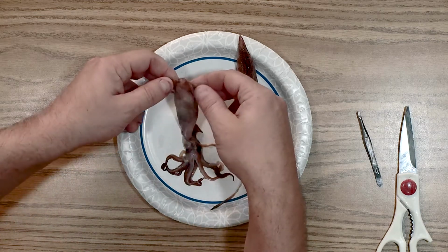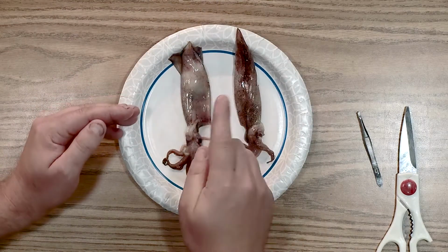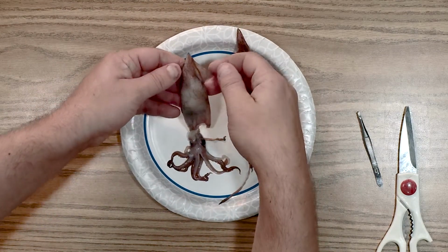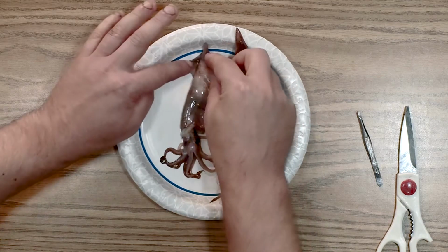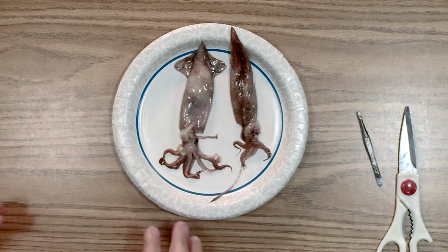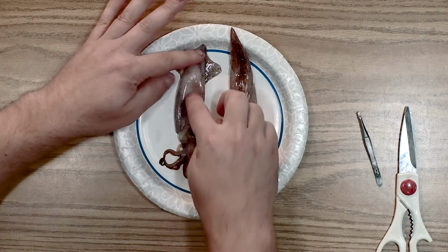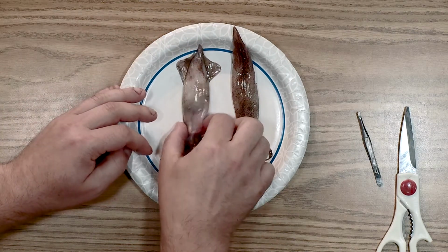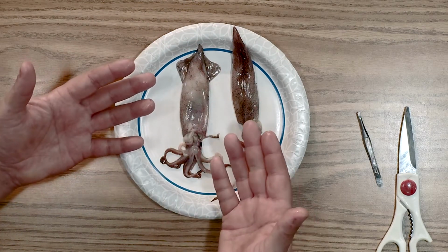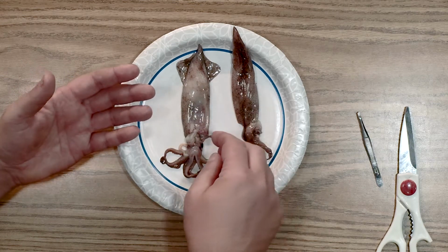Now, looking back over here at the squid, some other parts we're going to look at is the squid swims with this direction. So it swims with the pointed part of its head here going first, and it's got these two kite-like fins you can see that branch out. And those fins kind of work like wings on an airplane and help it guide in the directions and turn and tilt and move through the water. This big major part of the body is actually technically its head, and it's referred to as the mantle. And this is the main outer portion.